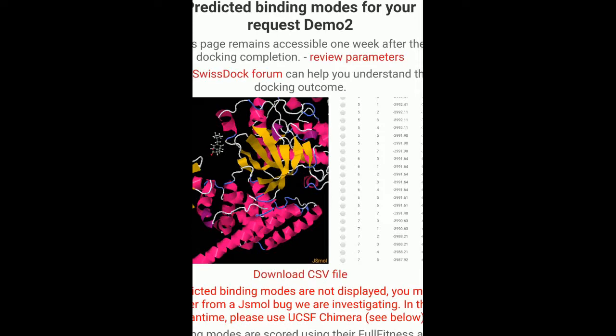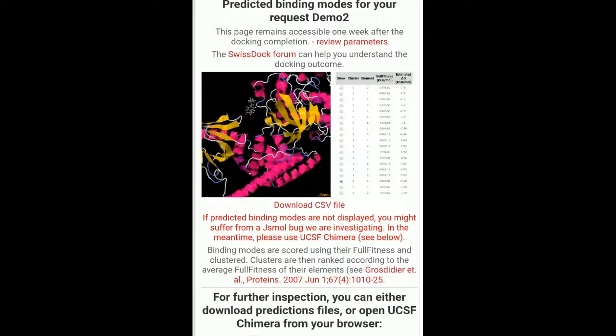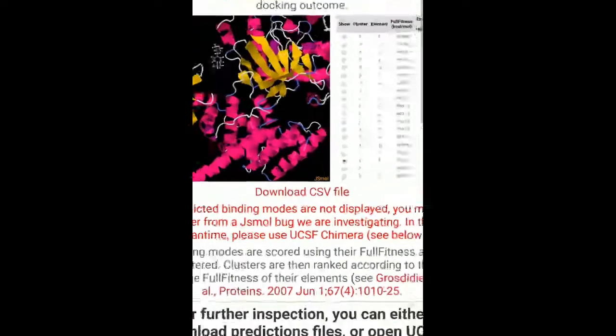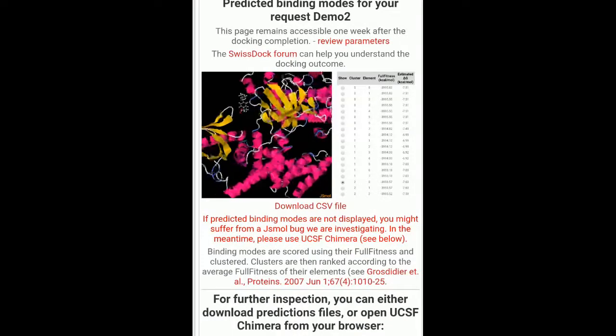This is how you actually perform docking using SwissDock. You can download the CSV file and get the entire list of your docking scores. You can also download the PDB structures — the ligand poses and the protein structure — and you can visualize this in Chimera, as they have suggested, or you can also view it in PyMOL. Or if you just want to have a look at how it looks, you can see it right here.